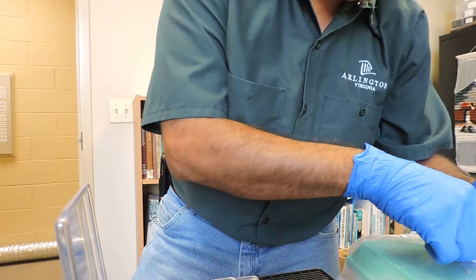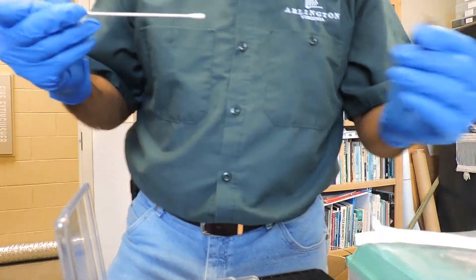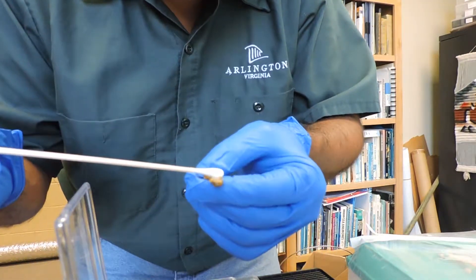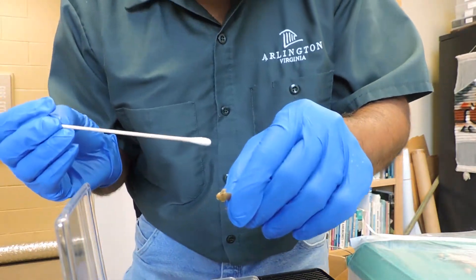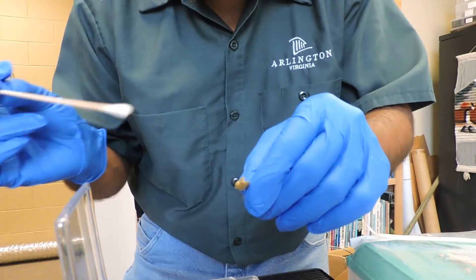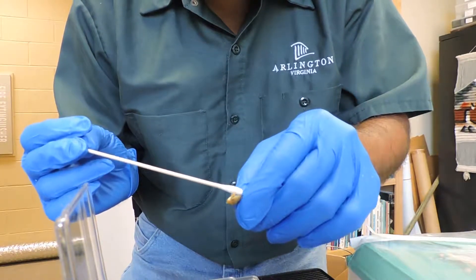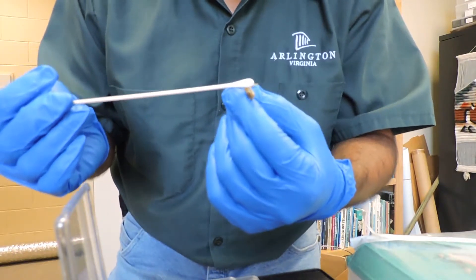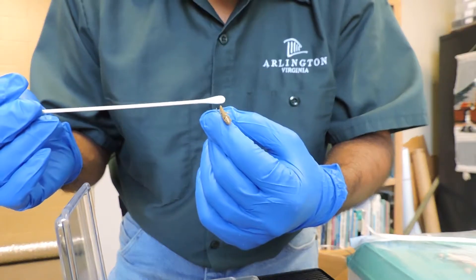I'm grabbing a sterile swab now. This swab is going to be used five times along the belly — one, two, three, four, five. Testing one is better; we test one and make sure the whole population is clean. Then five times on one side and five times on the other side.